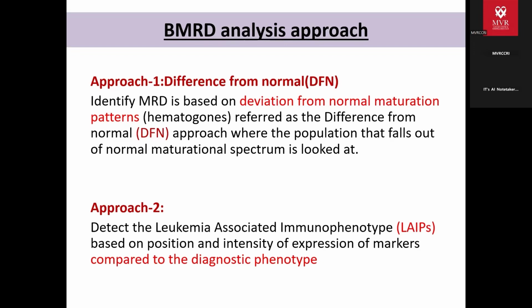What is the advantage and disadvantage? Most of the time, we use a combination of both approaches. We use the difference from normal, and in addition we compare it to the diagnostic marrow, so that we will be able to call an MRD positive more confidently.